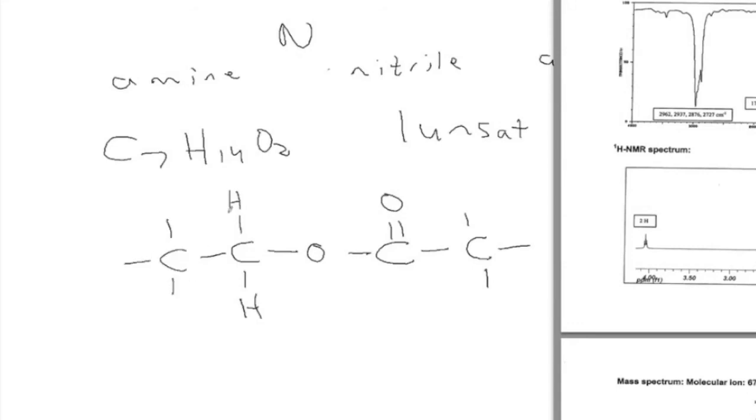All right, now this is something I think it wasn't clear to me that you guys had quite worked out. By working away from the oxygen, we know for sure that this is a CH2 group over here. Good. And doing a little more, can we figure anything out from the splitting of these hydrogens? Yeah, it's a triplet, so it must be next to two other hydrogens. So the group next to it is a CH2 as well. So notice how I'm working away from this oxygen, figuring out more and more definite stuff.